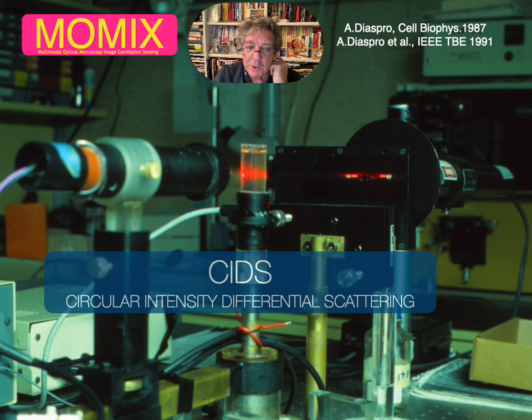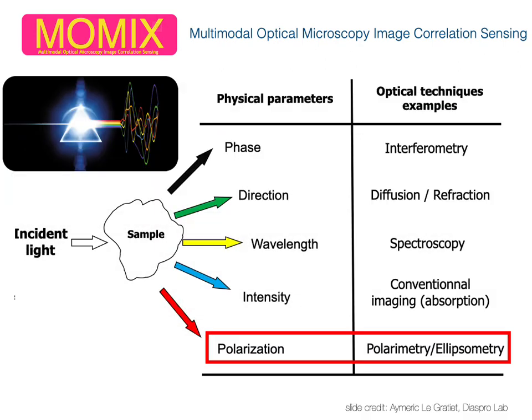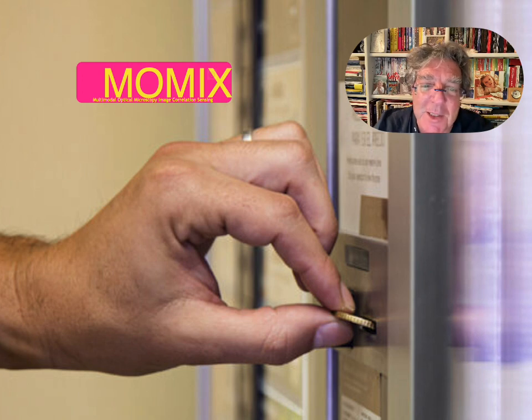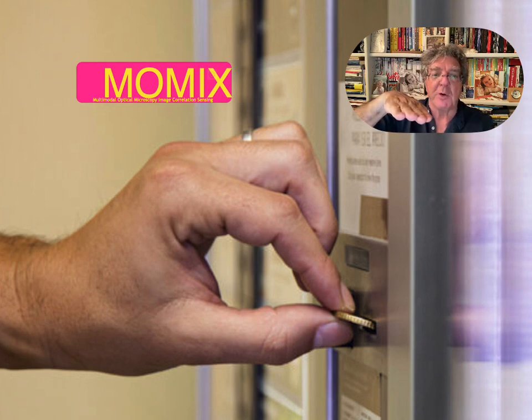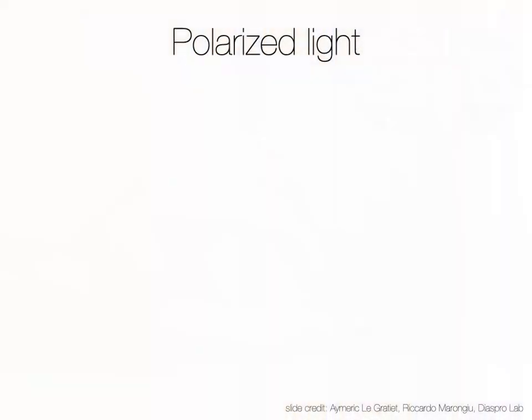The method I bring to your attention is called circular intensity differential scattering. It's nice. You have your sample, you shine light, and instead of detecting only the intensity, or in our case also lifetime and other issues, you work on what is called polarization. Well, at the coffee machine, polarization is a nice issue. When you go to the coffee machine and you insert your coin in a polarized way, right? If you insert it at 90 degrees, you don't get any coffee. If you throw your coin rotating in space through the machine, you have a chance to get your coffee. Well, you can play a similar game using polarized light.